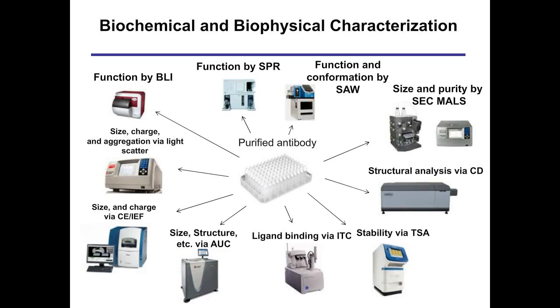So finally, I will talk about biophysical and biochemical characterization methods. Oftentimes, as I showed in these previous few slides, when you're performing any particular study, you will lean quite heavily on one particular method or one particular instrument.